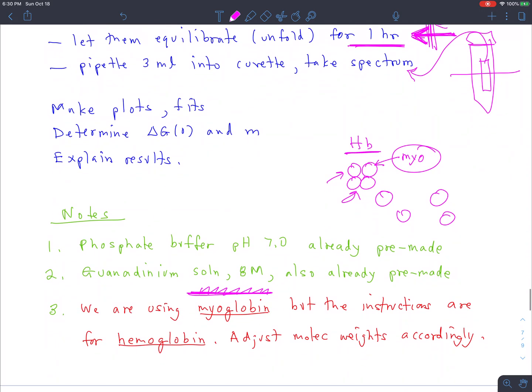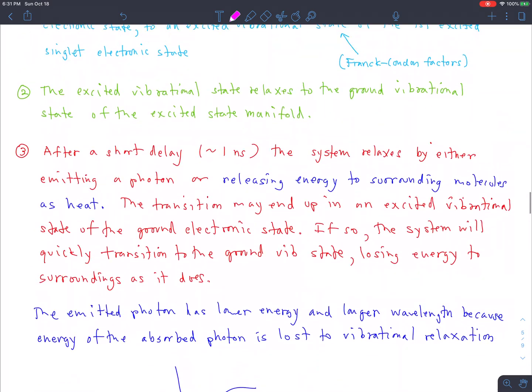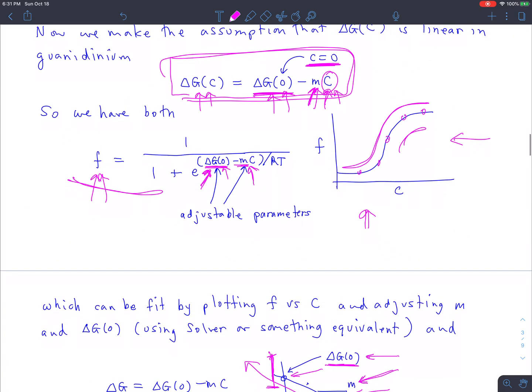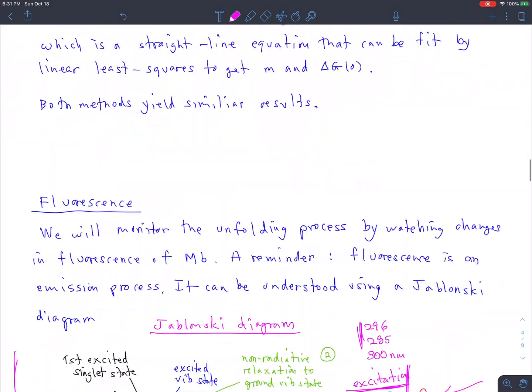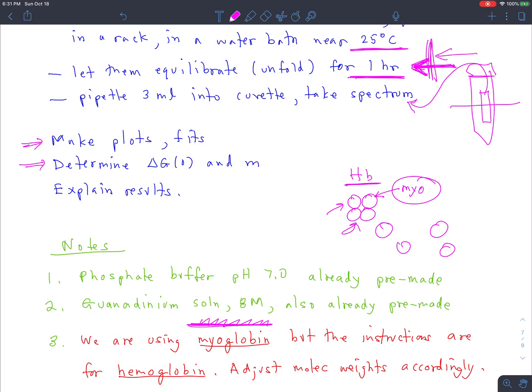All right. So we're going to make plots like I showed up above, either this one or this one. And from those, we're going to determine the value of delta G0 and the value of the slope. The value of the slope isn't of great interest, but the value of the delta G0 is, and that's out there in the literature. I'll tell you, it's something like 45 kilojoules per mole.